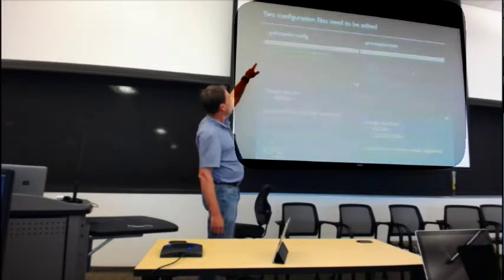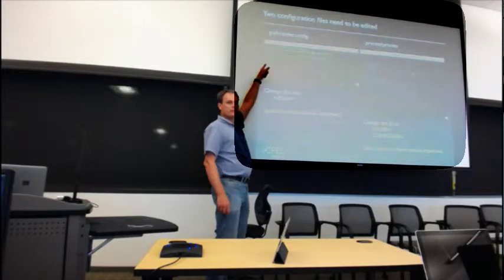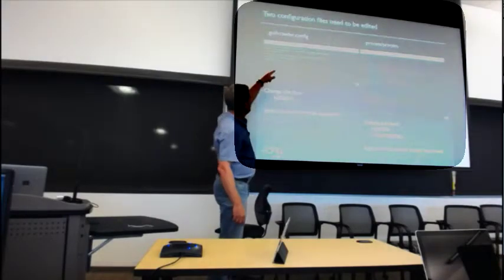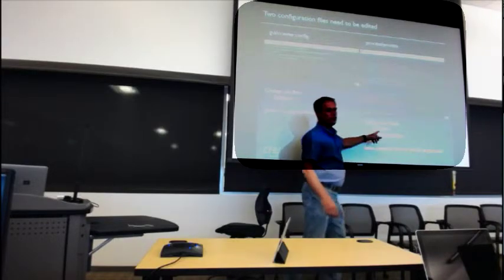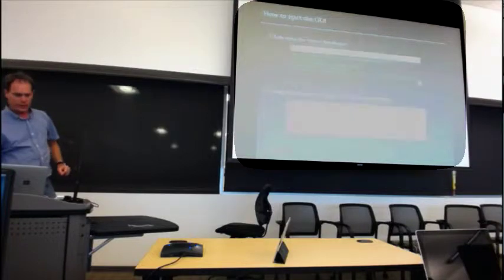They'll be inside whatever directory you pull it out to, a GUI crawler.config. This tells the front-end GUI where to look for the files, where the XTCs are, where the HDF5 files are. There's one line to change there, and then there's another script that launches all the batch jobs, and you need to change 2 lines there. I'll get to that. Don't need to do that right now.